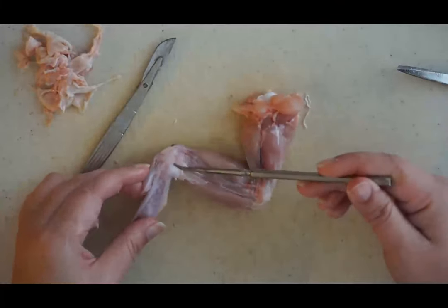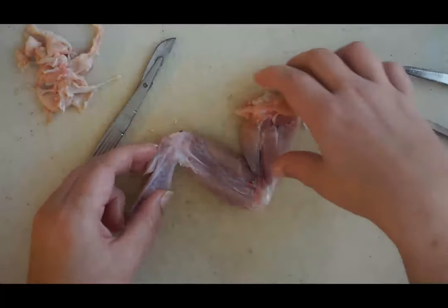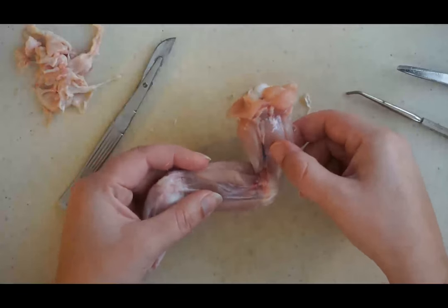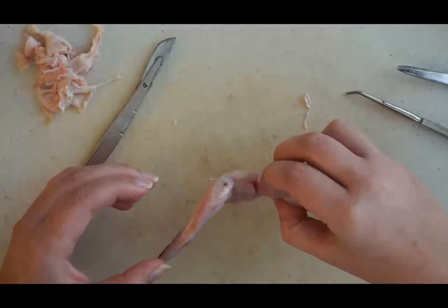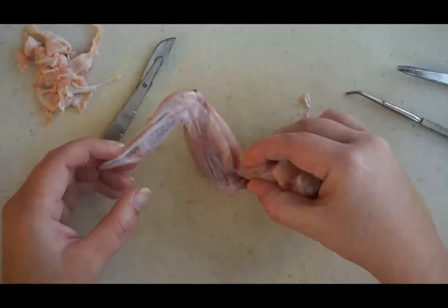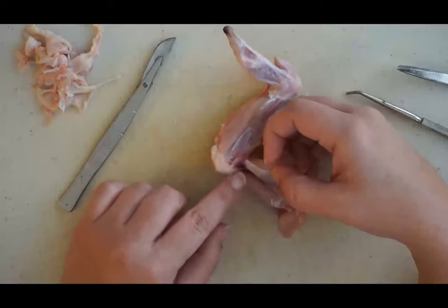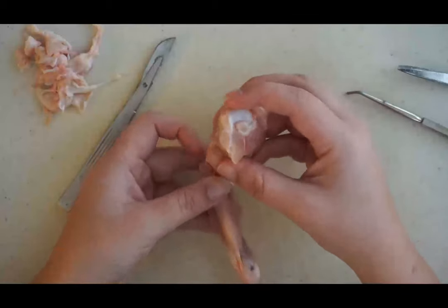We have the elbow joint and the wrist joint just so that you can visualize what you're looking at. The bicep muscle is found right here on the wing and then the tricep muscle in the back. You can actually contract the bicep muscle causing the wing to move, just like if you contract your bicep muscle your arm will flex. As that bicep muscle flexes, the tricep on the back actually extends and relaxes.